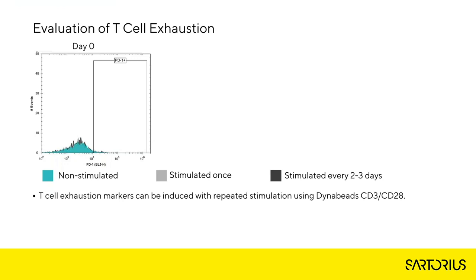Dynabeads activate T cells via the CD3 T cell receptor pathway and also provide a co-stimulatory signal via anti-CD28, mimicking the interaction in vivo with antigen-presenting cells.